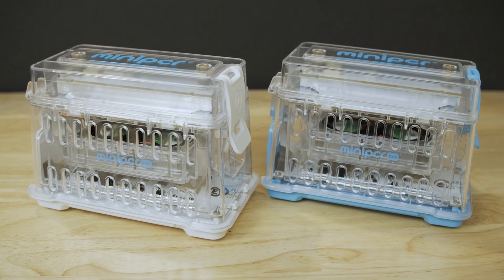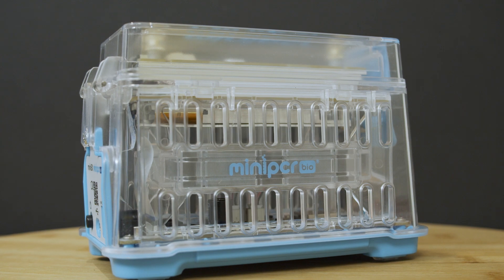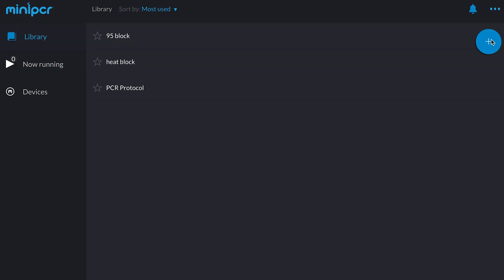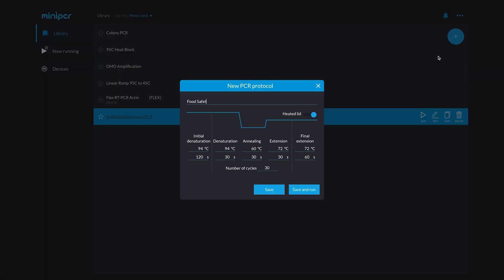Mini-PCR machines are small, durable, fully functional thermal cyclers. They allow users to create a wide variety of thermal programs, including polymerase chain reactions, heat blocks, and temperature ramps, using a simple app interface.